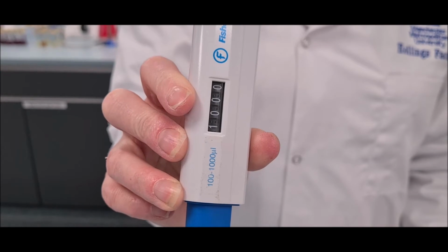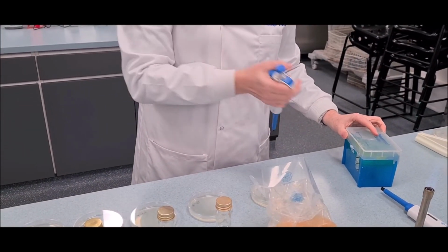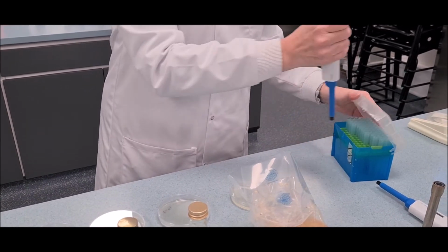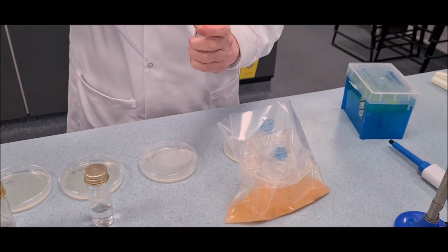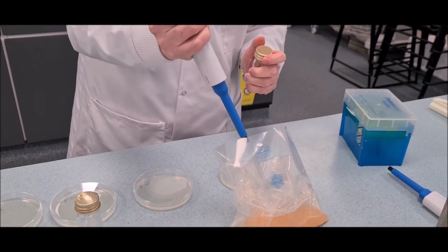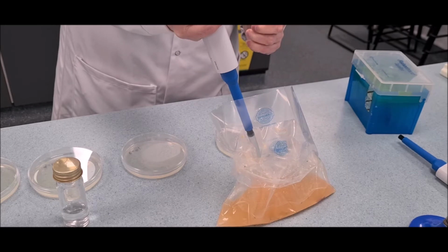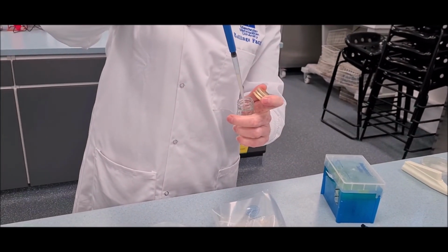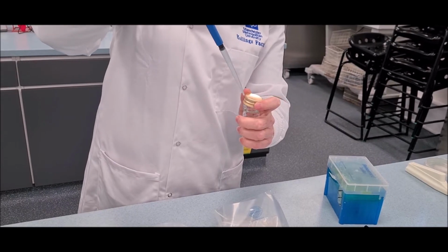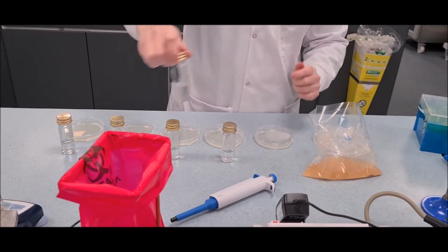Using the 1000 microliter micropipette, aseptically transfer 1 milliliter of the homogenized sample from the stomacher bag into the first dilution bottle. This gives us a dilution level of 10 to the power minus 2. Mix very well using the vortex mixer.